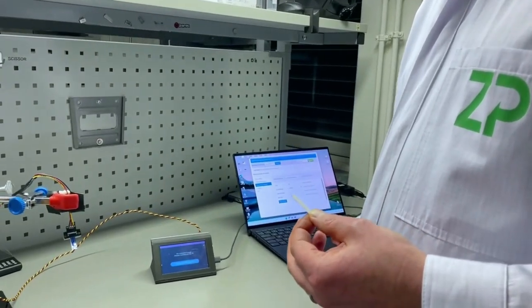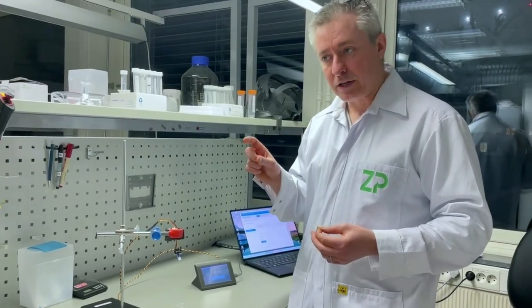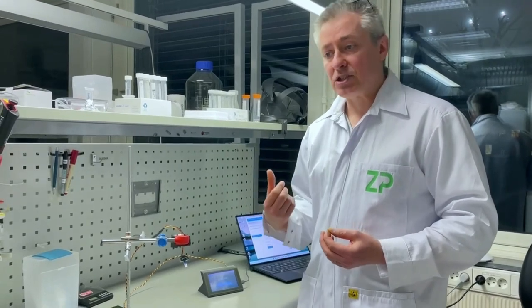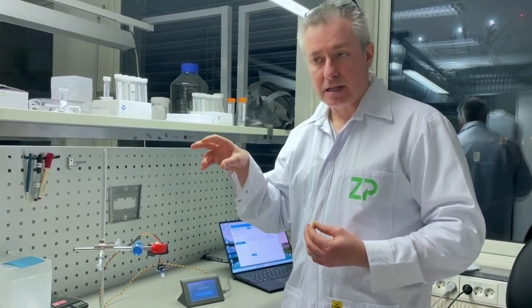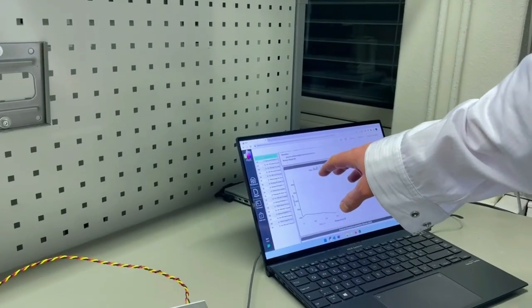At that point it runs the device. I'm going to interrupt it a little bit quicker and not let it finish its run, but what it's doing is running the experiment, and rather than asking where is my data, it actually sends the data to the cloud. You're able to log in with your username and password to see your data, and you can share it with your PI, a fellow student, or a fellow co-worker.